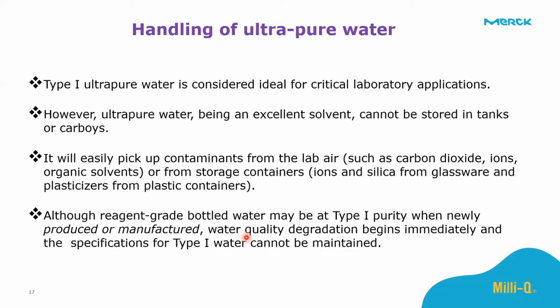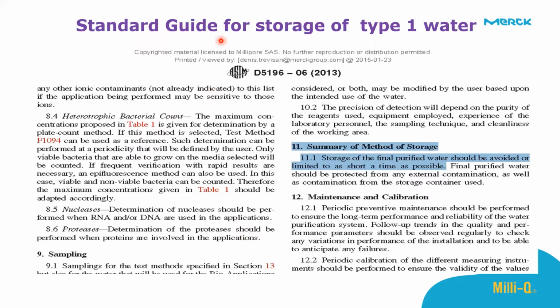And this is actually supported by ASTM D5196-06 of June 2013. I just want to cite this here, which says storage of final purified water should be avoided or limited to as short a time as possible. So meaning, just like we said, freshly prepared and used immediately.